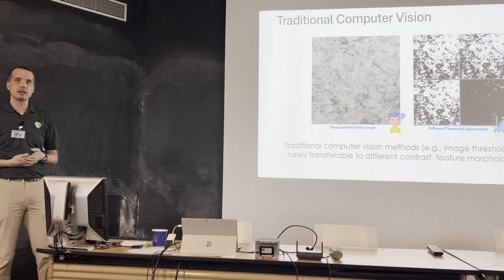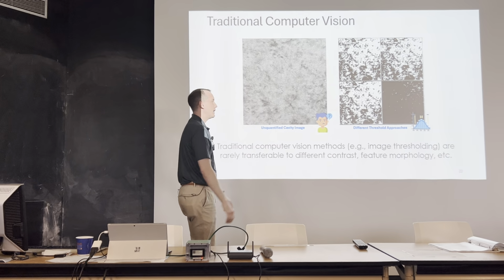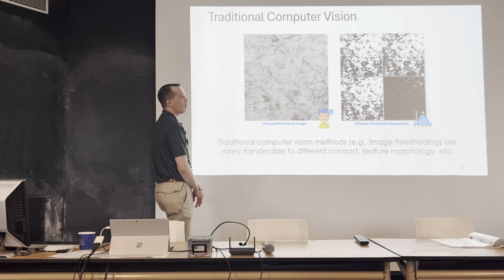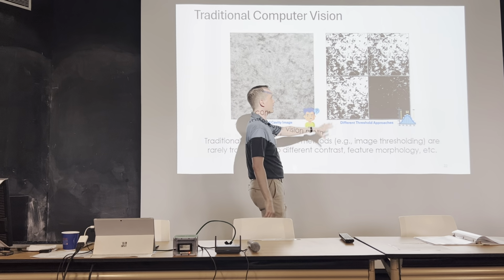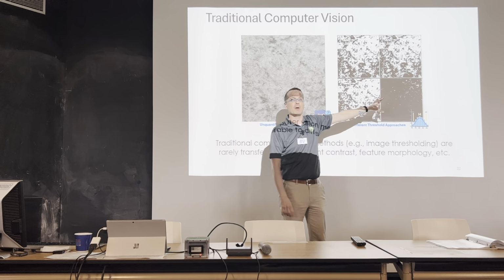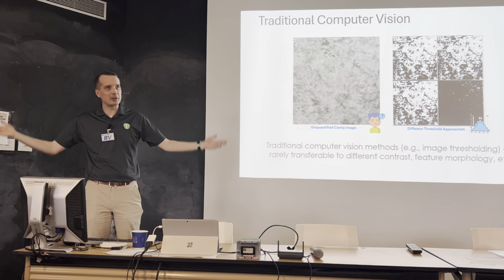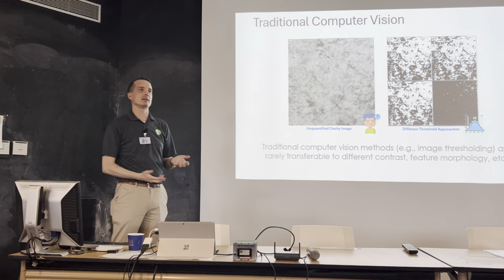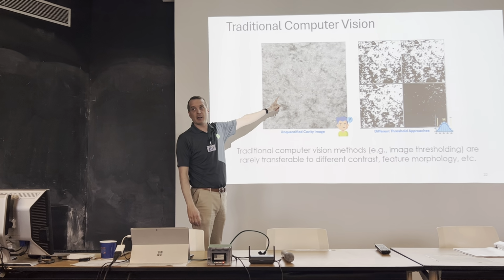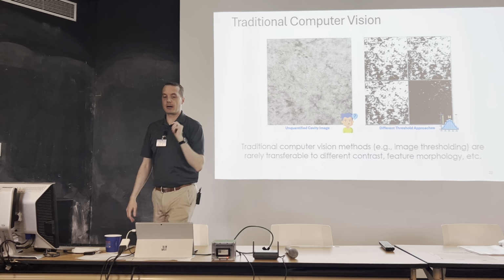And the question ultimately then is, you start off and you say, well, what is out there? And you start off with thresholding, you use ImageJ, you start playing around with that stuff to see what it is, and you ultimately spend a whole summer or more trying to get your one model to work, your one workflow, on one particular image, and it works really well for that one. Then you apply the second one, and it does not work at all, right? And so now you abandon that, and you eventually go back to manually annotating all those images, right? And because now we're sitting here and you're looking, I apologize, these are not black dots, you want the white dots in this one. That's maybe 200 to 300 of them in there that you're trying to grab, right?